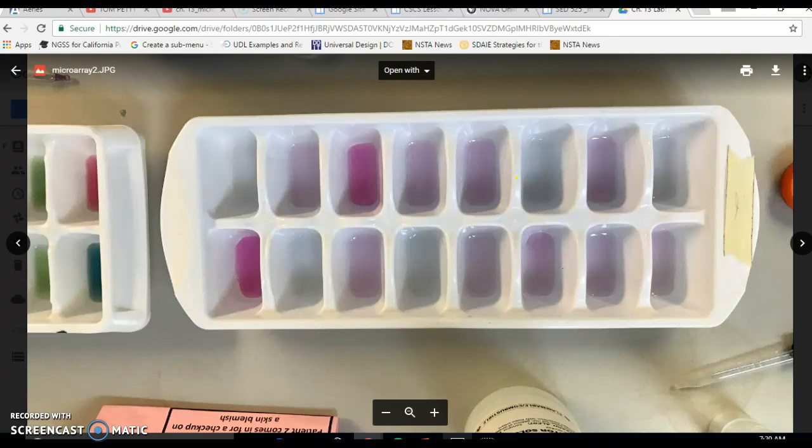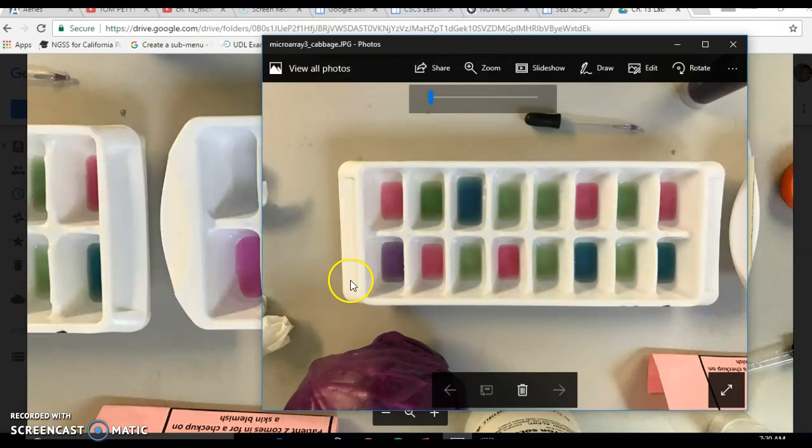So let's look at the other option, which is the cabbage version, which is what this video is made for. And you can see clearly there are strong differences between identifying a gene as highly active, inactive, or normal functioning.